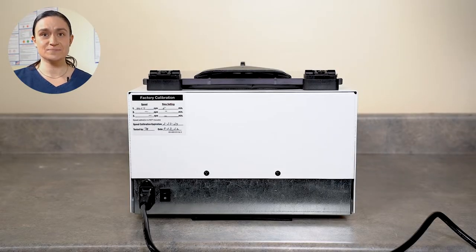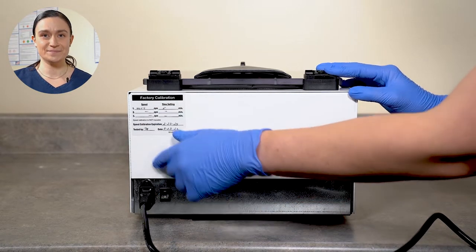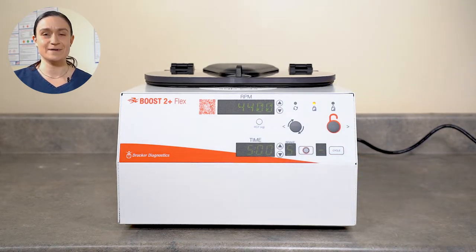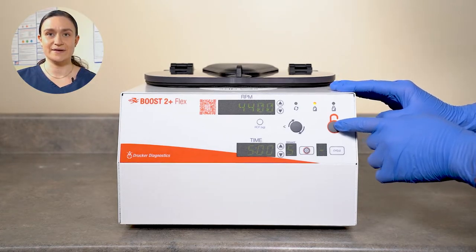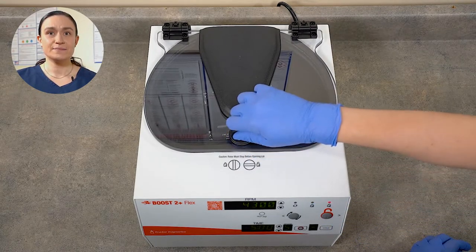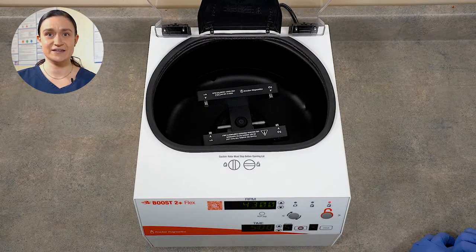Once you've got the centrifuge plugged in, locate the power button on the back and turn it on. Once you turn your Boost 2 Plus Flex around, you should see that the displays have illuminated, which means your centrifuge is successfully receiving power. To unlock the centrifuge, press the Stop Unlock button on the control panel. If you want a more in-depth overview of the controls, a link to that video is popping up on your screen right now. Once we've hit Stop Unlock, we can open the lid by pressing down gently on the lid latch and turning it a quarter turn counterclockwise, then lifting the lid open.